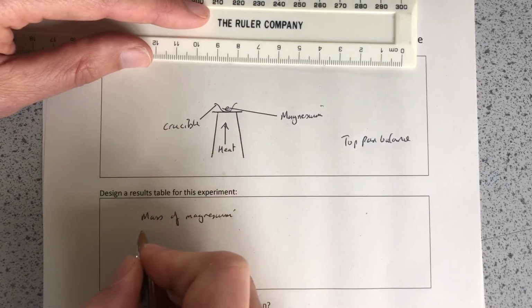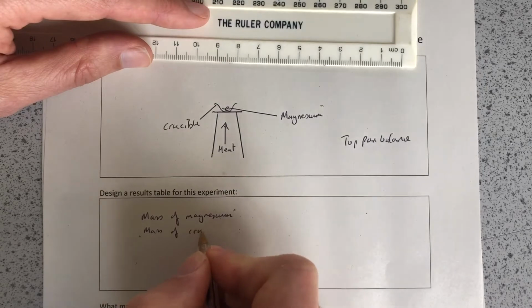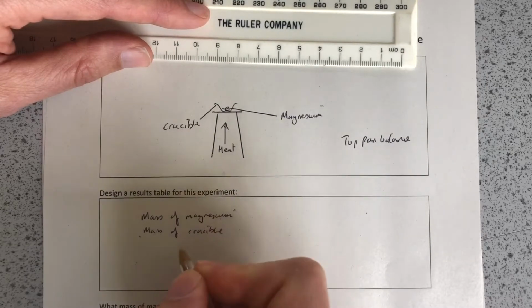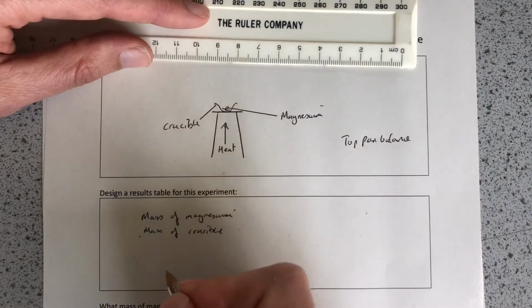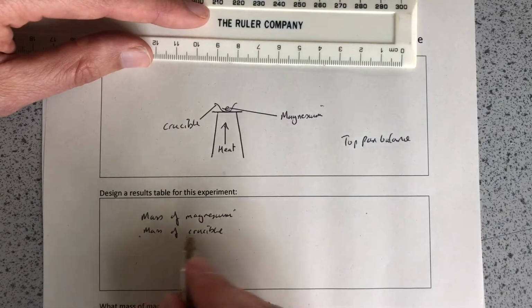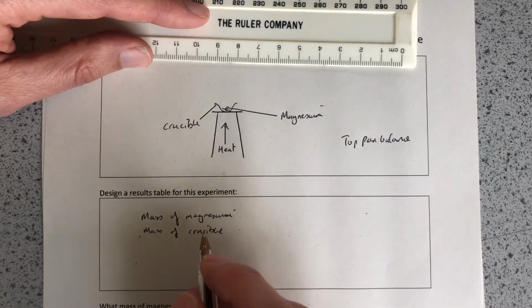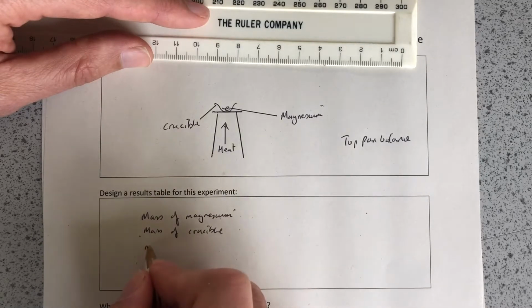Okay, we're going to need to know the mass of the crucible, because we're not going to be able to scrape all the magnesium oxide out at the end, so we're going to have to weigh the magnesium oxide in the crucible. So if we have the mass of the crucible to start with, we can subtract it from the mass of the magnesium oxide as well. So that's our next reading.